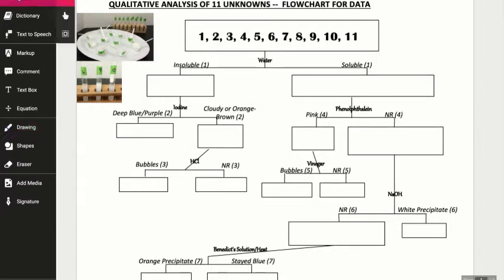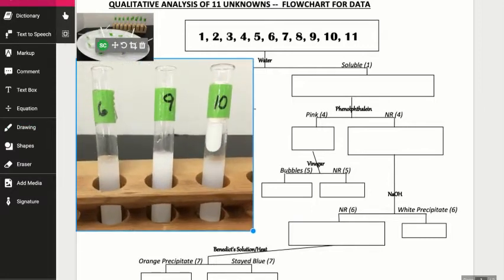same ones you saw in the Google form. But here are the 3 substances that come out cloudy. That's what you were supposed to be looking for as a positive result here. They're cloudy because they're not dissolved.